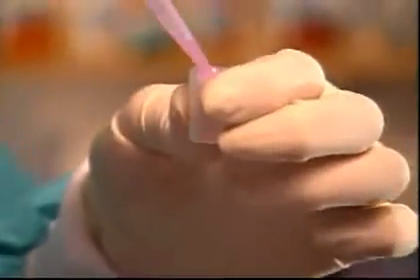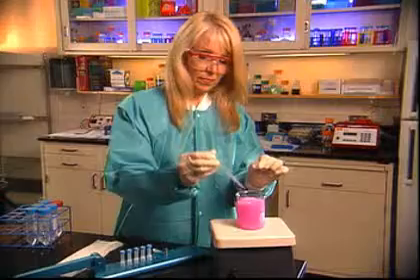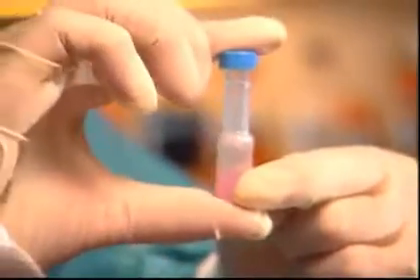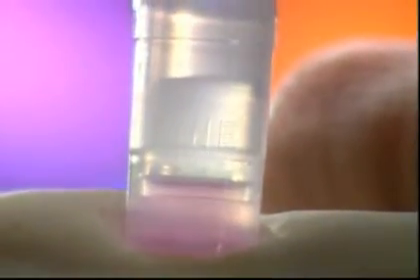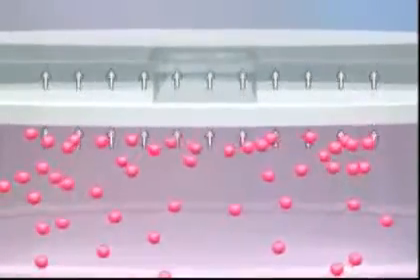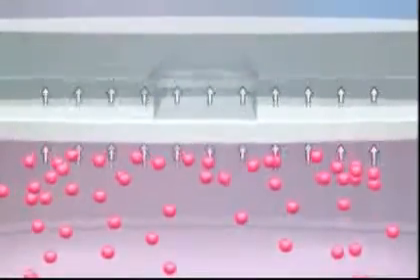Fluid is placed into the collection chamber. The plunger is inserted into the collection chamber, and the two pieces are squeezed together. This presses the sample through the membrane, successfully removing particulates as the fluid moves into the upper chamber.